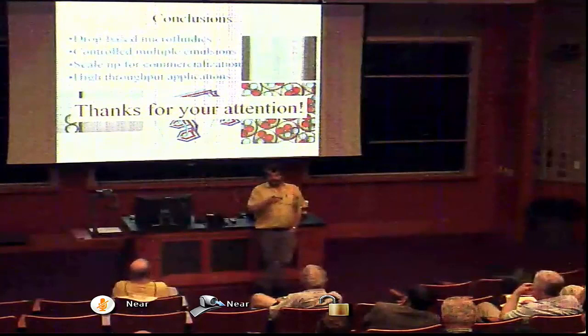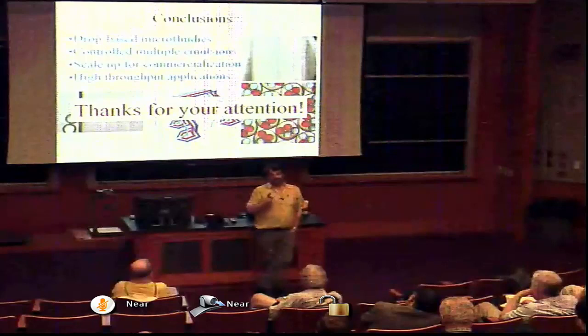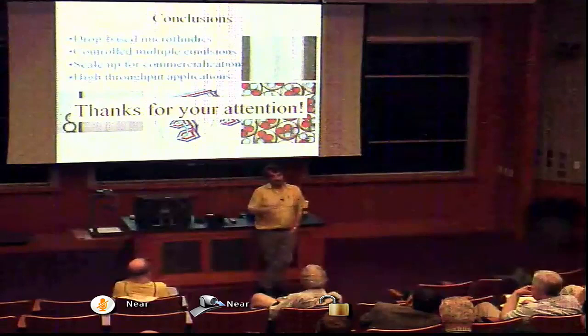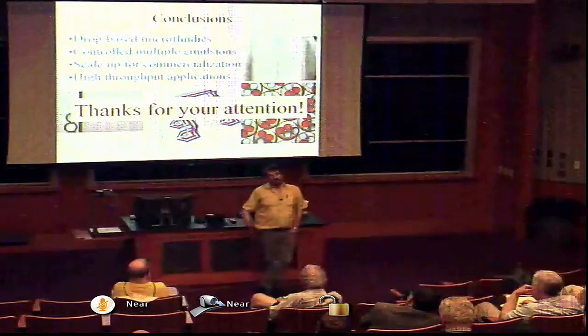But now if you look at the state of the art of microfluidic technology commercialization, the companies that were successful in the early days that used valves to move fluids around, to control fluids, those companies are all failing now because that's just too complicated. Drops are now really starting to take over. So now there's a lot of companies that are starting all sorts of things that use drops. And now it's getting to the point in my lab where maybe two or three companies a year are coming out of the lab just because there's so many things that we no longer can do in our lab. They have to be pushed out to commercialize.